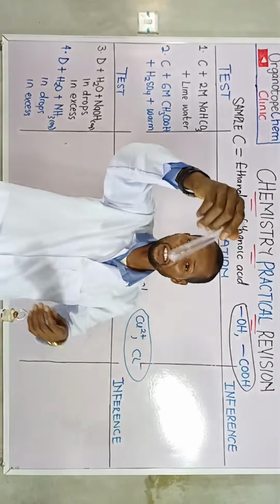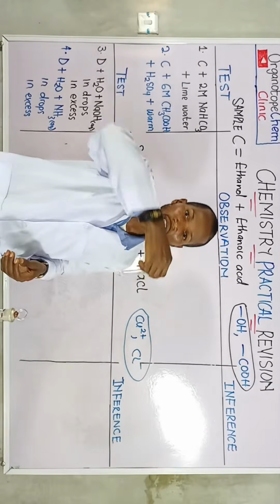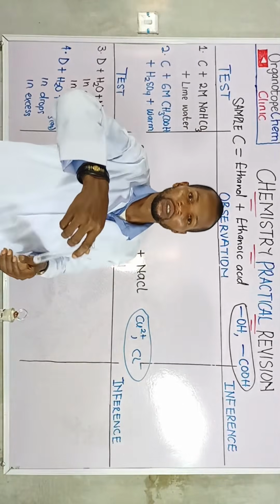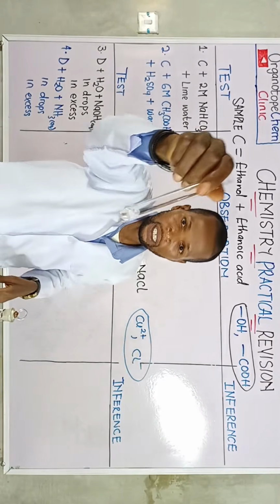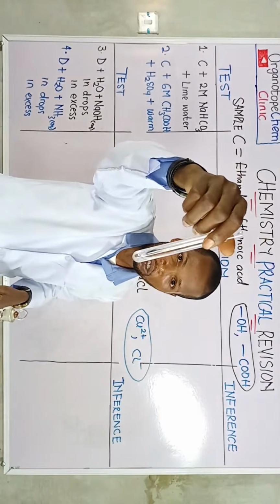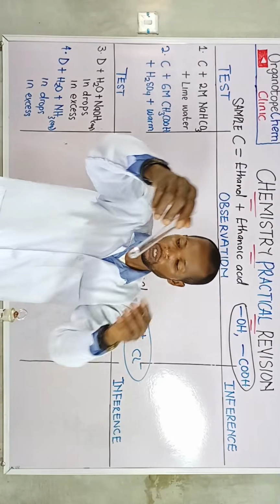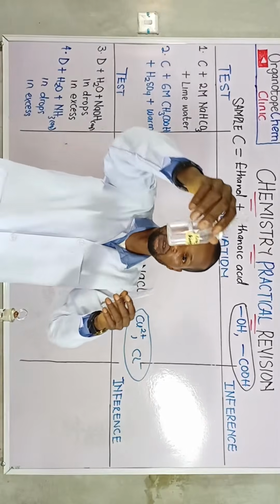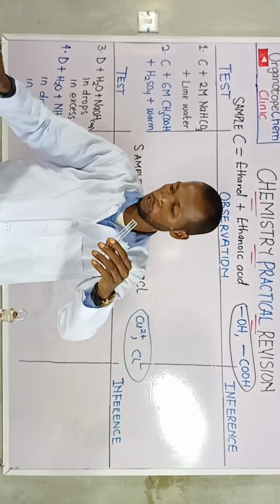Now, I've taken another sample of C as well as the sodium hydrogen carbonate. This is the second time I'm taking that. So when I shake this, you tend to see, if at all you could not hear me, you saw the gas coming out. So the next thing you are expected to do is to take the lime water, okay? You pass the gas through lime water.